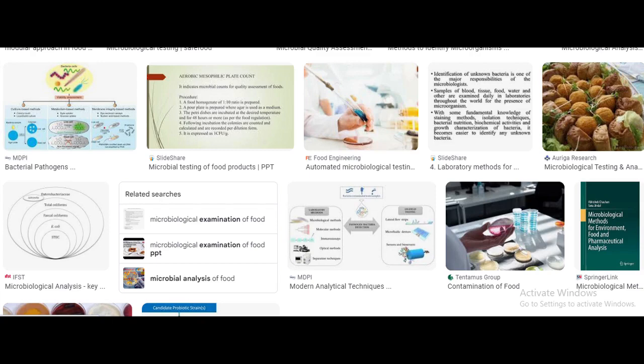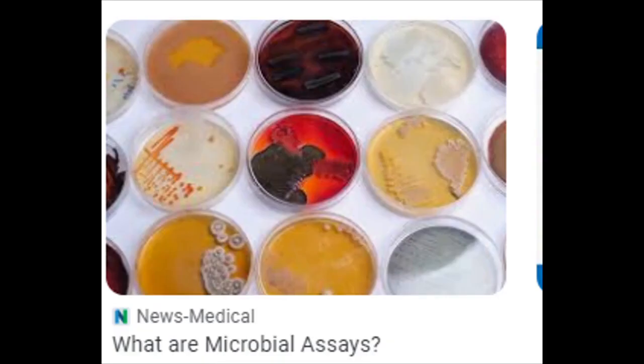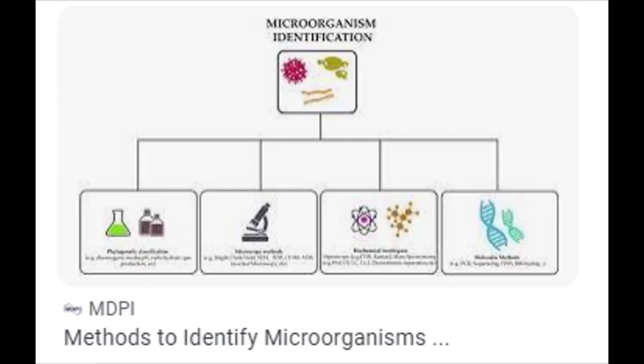So what do you do? Directly as they bring the rice, you examine it under the microscope in the laboratory. You put the rice in a small amount of sterile distilled water inside a test tube and shake it together. Then take about 1 ml or 0.5 ml of the water, put it on a glass slide, and put it under the microscope and look at it.